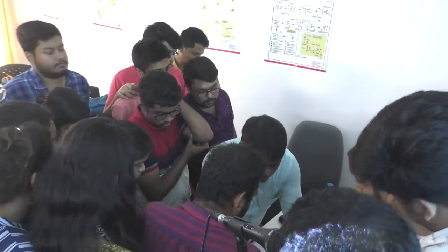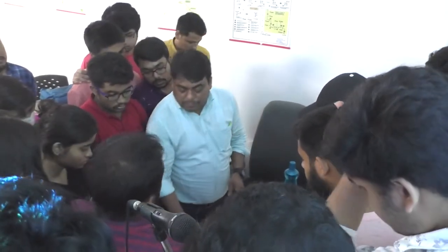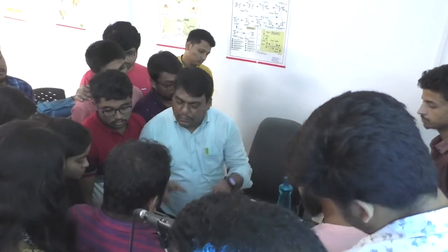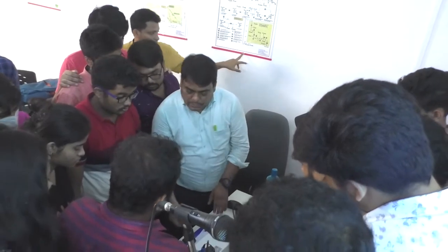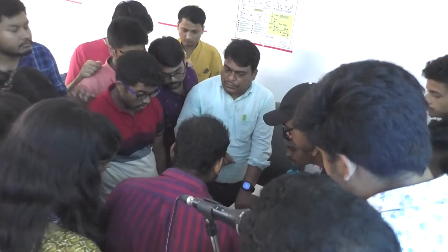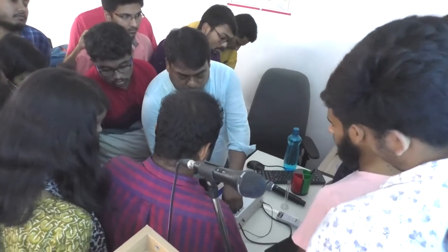Tissue paper is very good. So we connect this electrode from this row. Okay? And this is your glass electrode. You never leave this electrode in such conditions. You always dip this electrode in a solution. This is the first mandatory thing. Okay? Now, first of all, you have to set this knob to pH. Okay? This is a glass electrode.